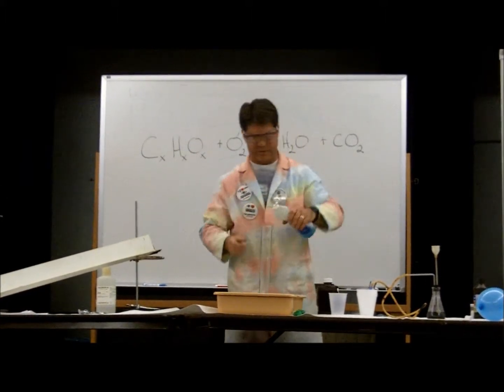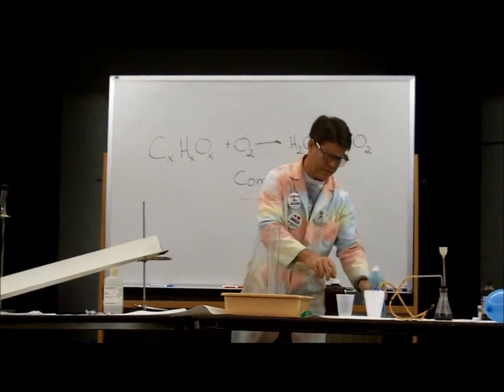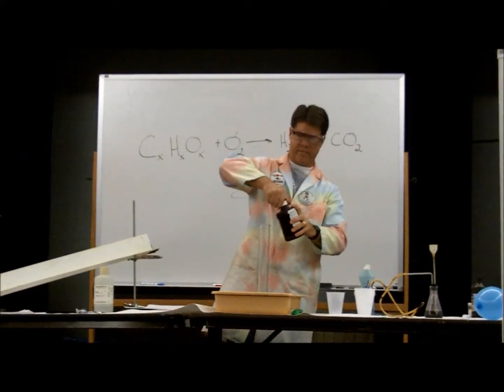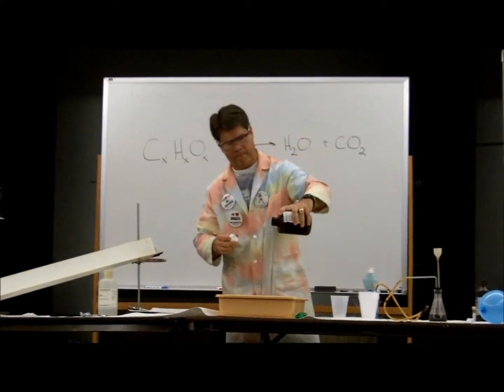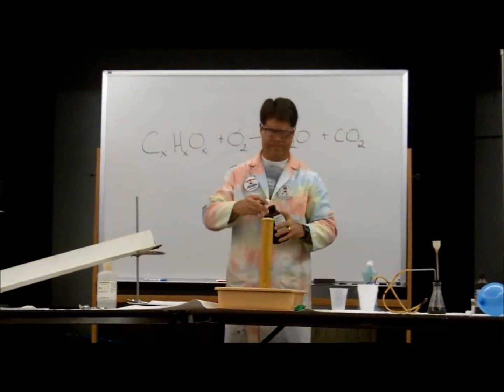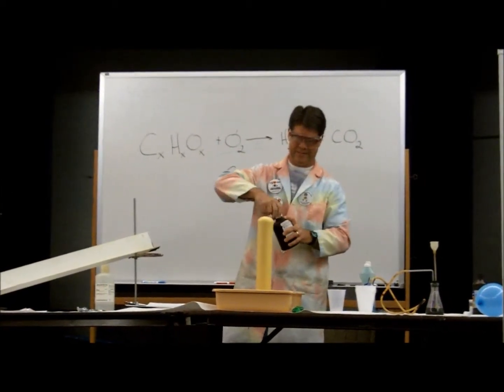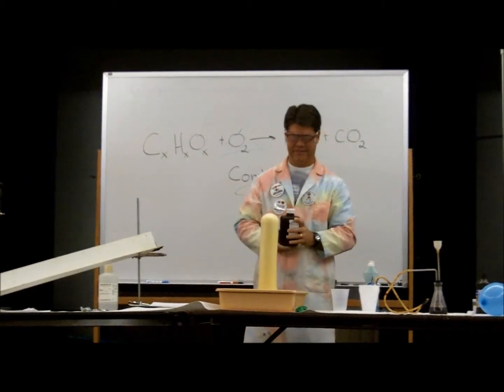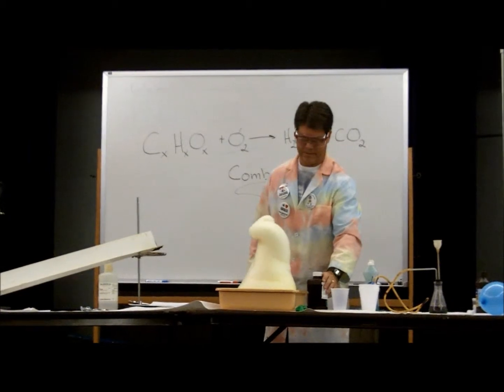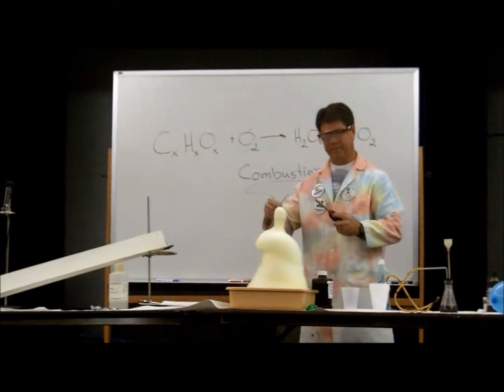And it can't look like toothpaste without bubbles. And then the peroxide. It's smoking.